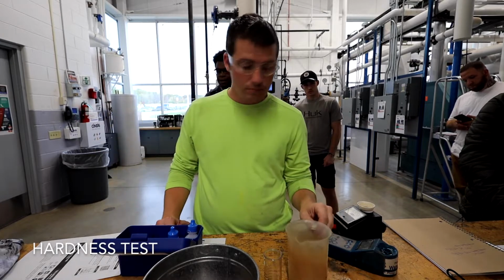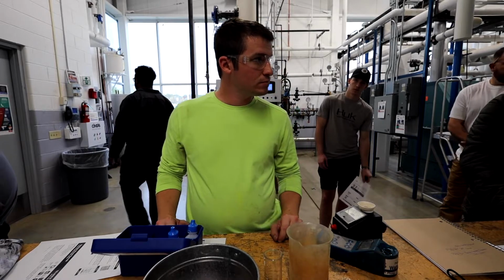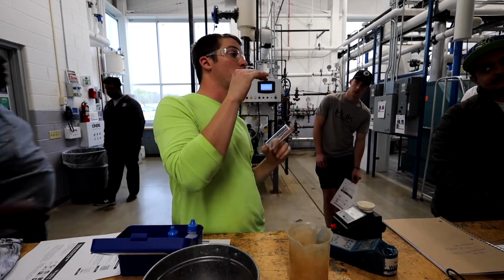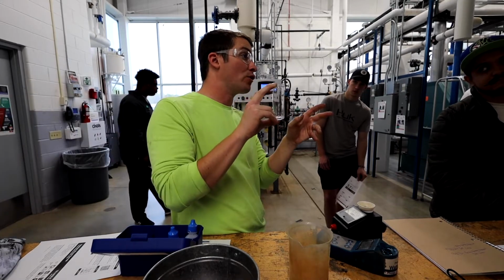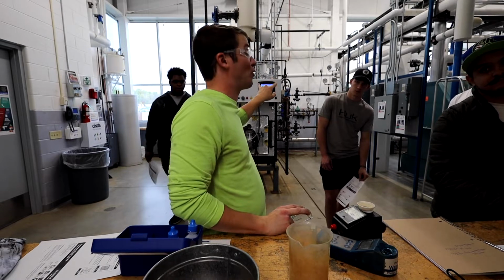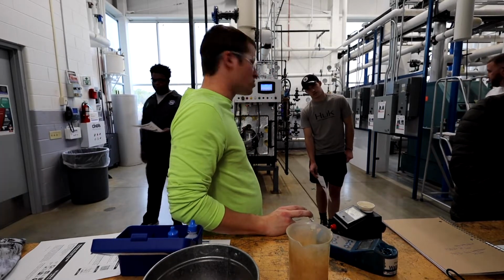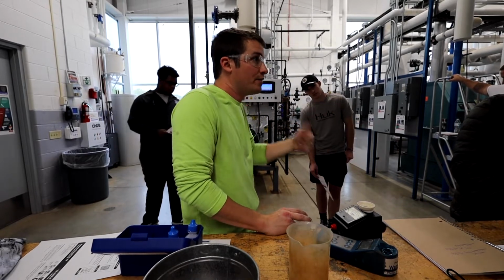All right. Can you show us like a missed test or something, like when it turned red or something? You able to do that here today, or? So that was a missed test in that it turned blue eventually, but I only want to be 1 or less. We were 4.5. Okay. So that is an error or an issue. We'll grab the softener and condensate, and we'll try to see if we can figure out which one of those is giving us maybe high hardness. I'm guessing it's the softener, but we'll test those and see. And we might find like, oh yeah, the softener is putting out 20 parts per million of hardness. Well, I wanted to put out 0. We know that's an issue, right? So and then this test would be blue?